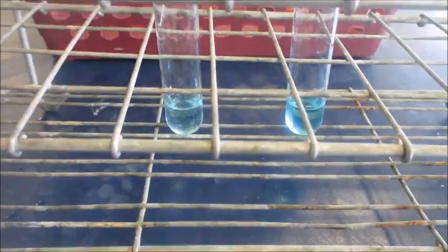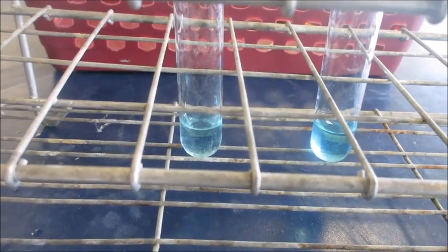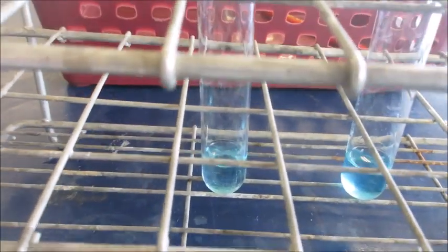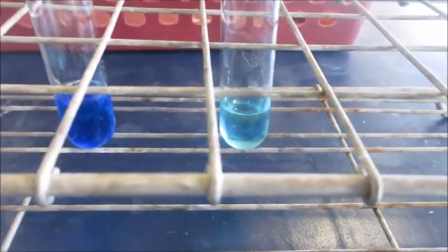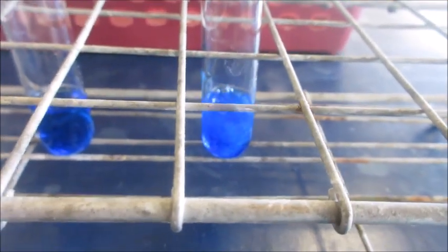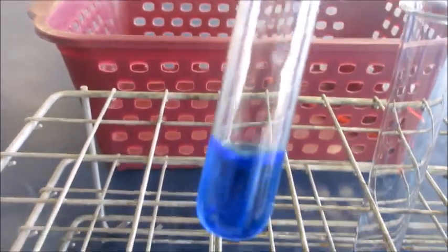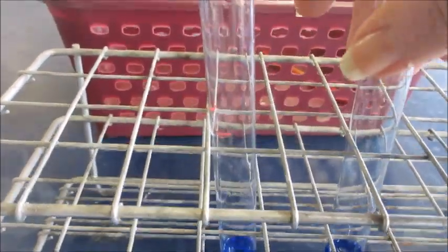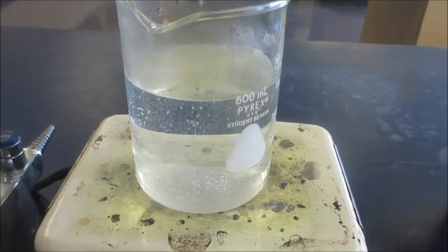Now let's see what happens when I place Fehling's B in the solution — ten drops into each test tube. This is before adding them to the hot water bath. They look pretty much almost the same. Now let's place them both in the hot water bath for a few minutes to see if there's going to be a change.